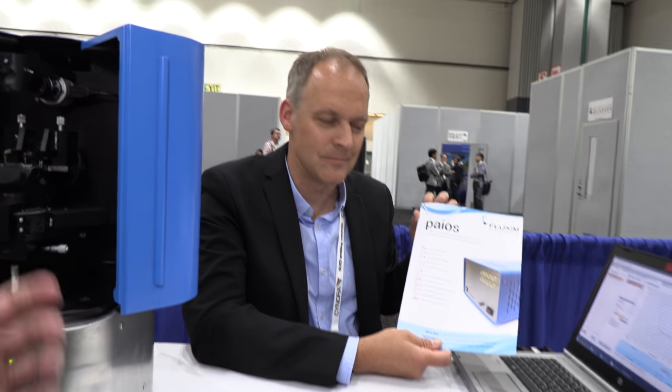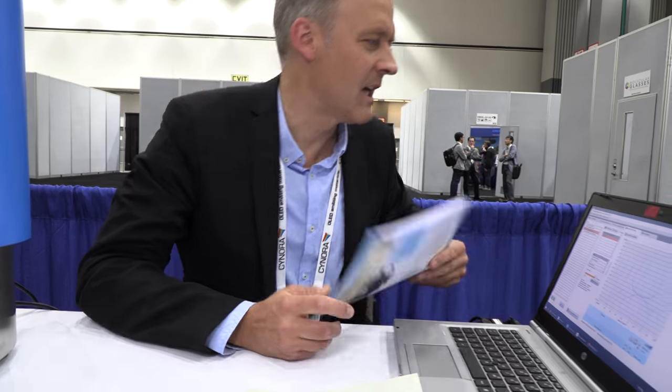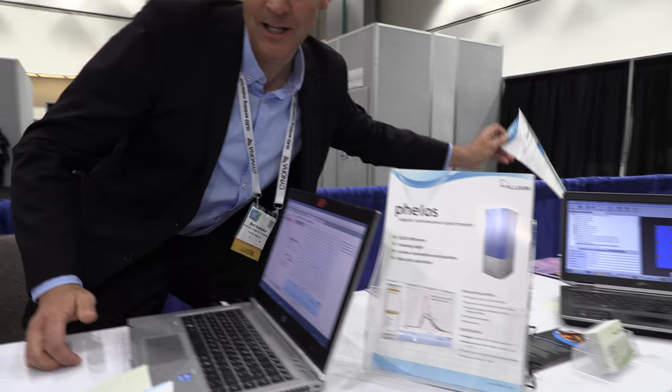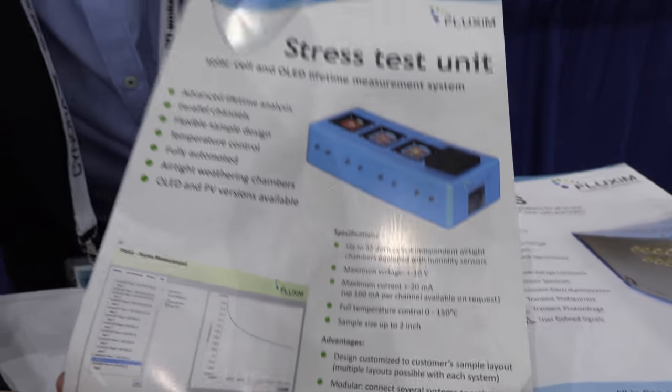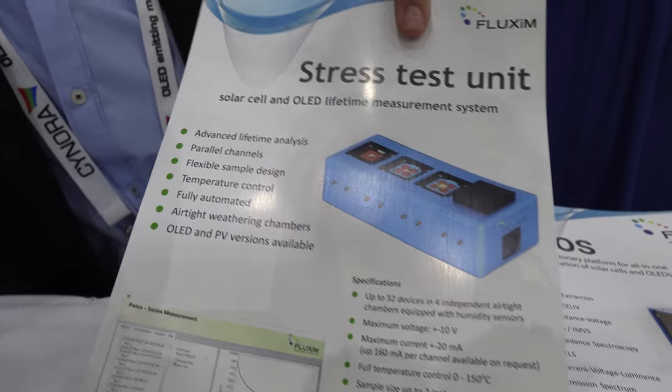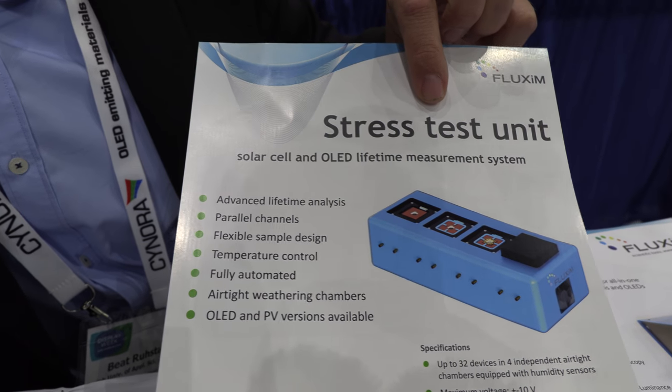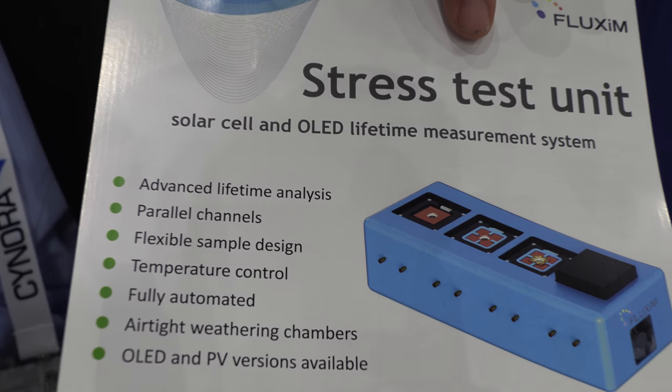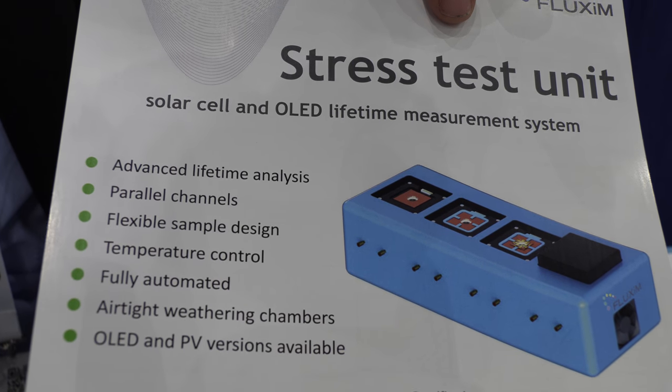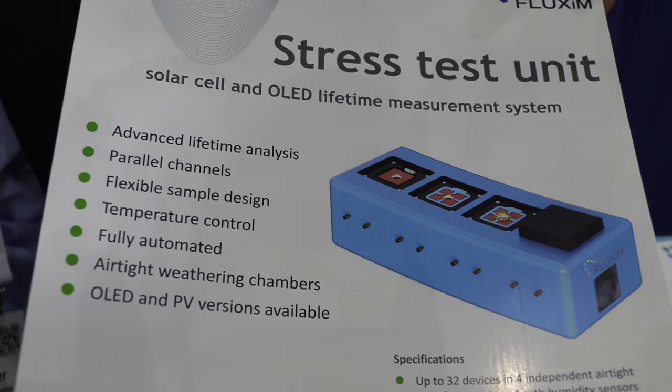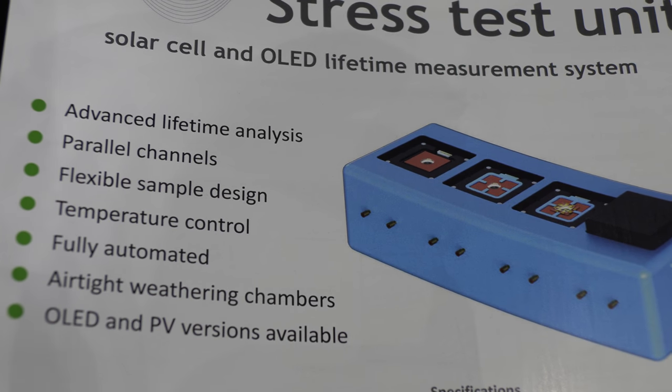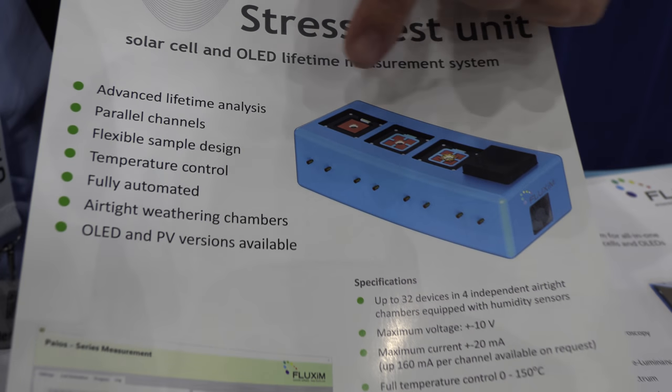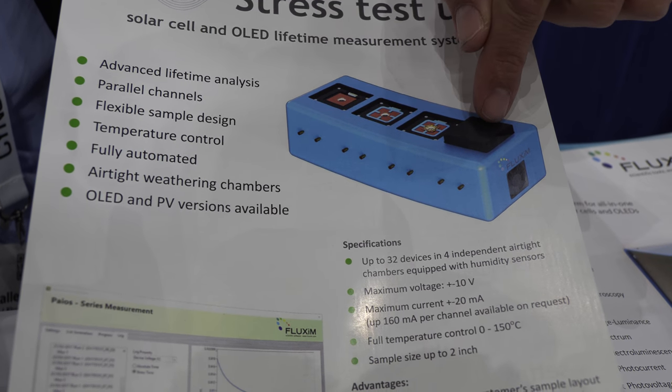And what's next? We already have something in the pipeline which is an extension. We also want to help the people to analyze the degradation phenomena that still occur. So this is a stress test system that can do accelerated lifetime testing at higher current density and higher temperatures. We have four different temperatures here in these stages.